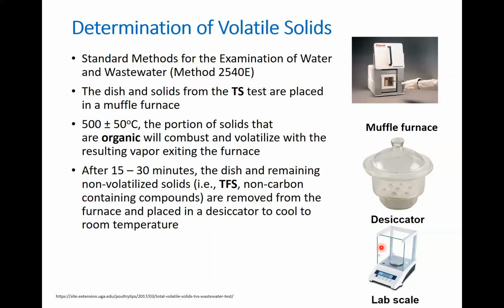Then, after we burn them for this period of time, sometimes you can also find references that go for maybe 1 or 2 hours. Again, there are several methods reported in the literature for this, but if you would like the standard method for examination of water and wastewater, you can refer to method 2540E.